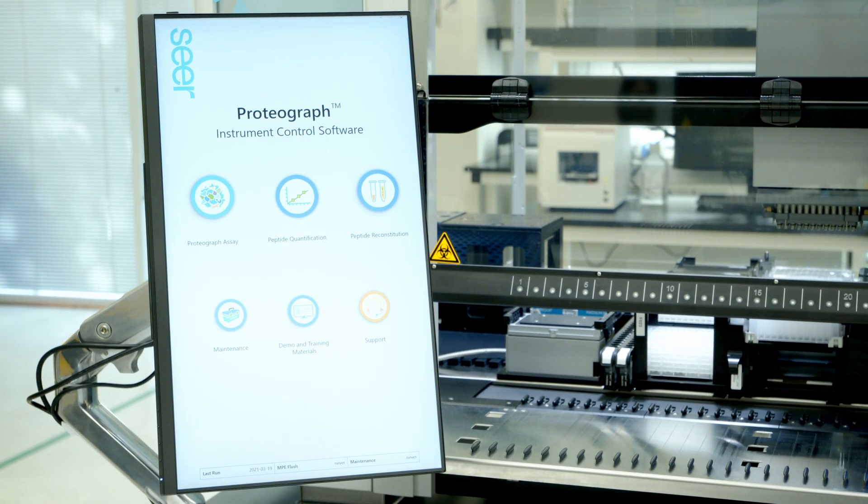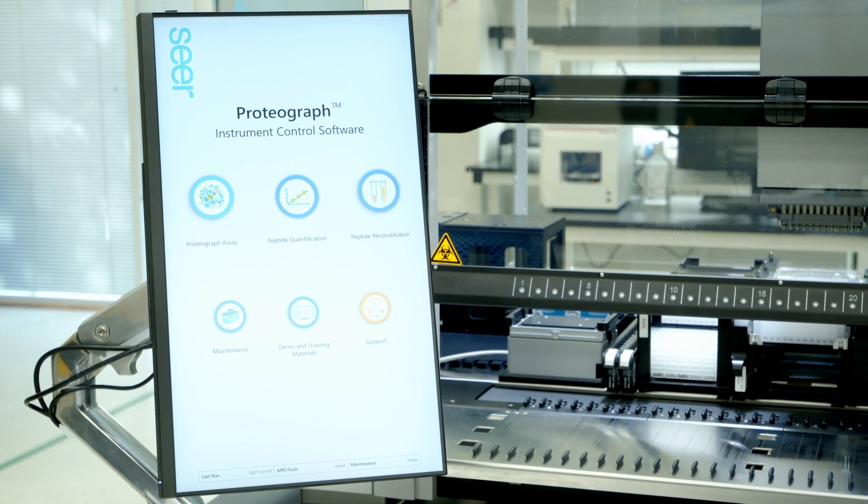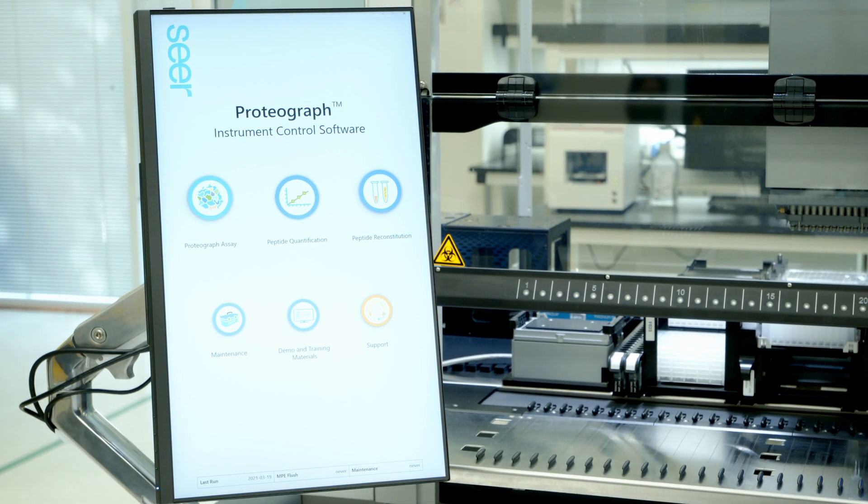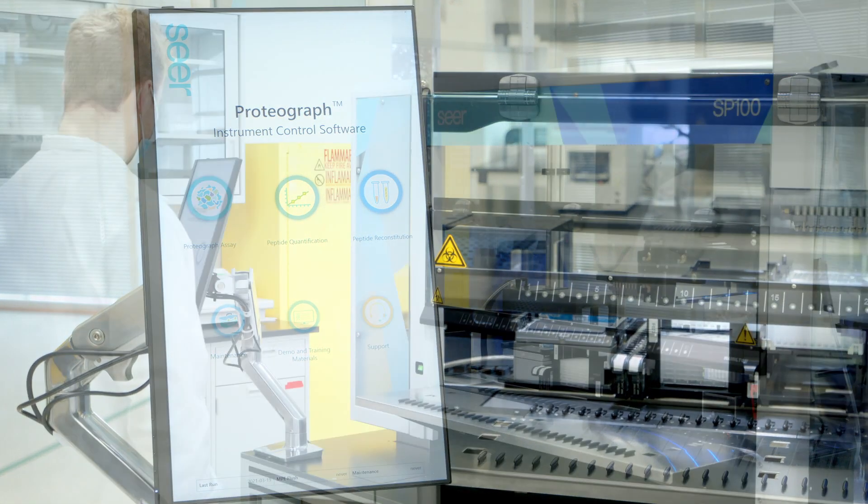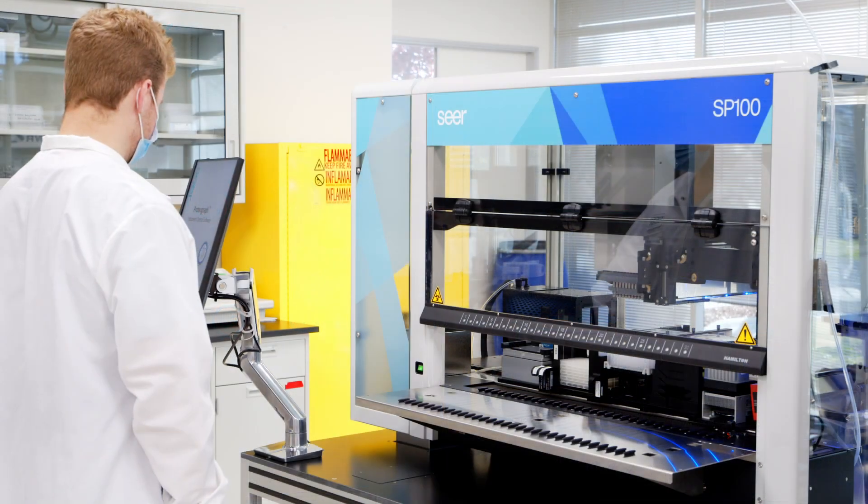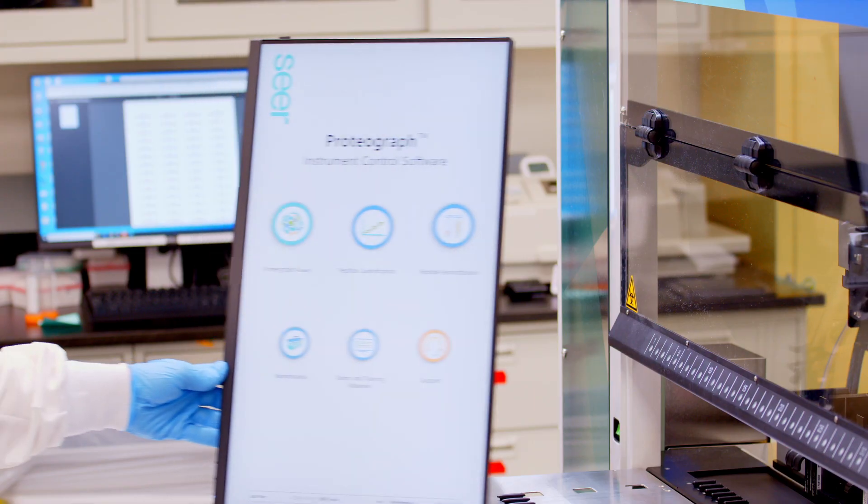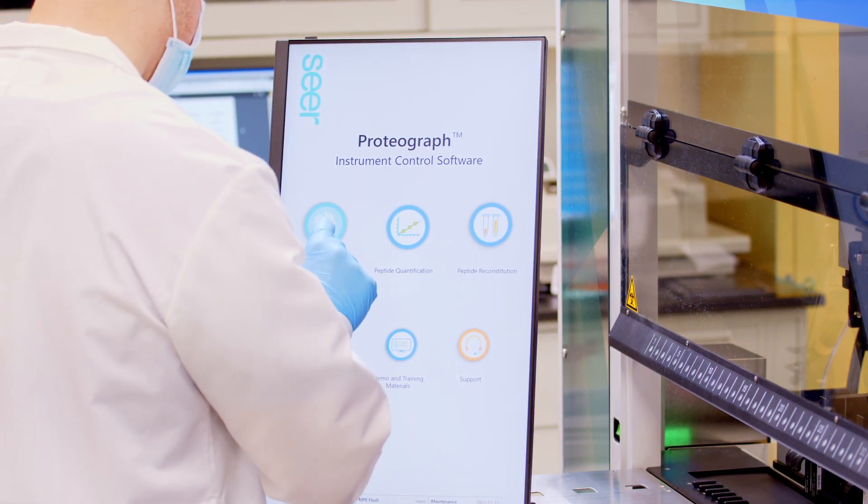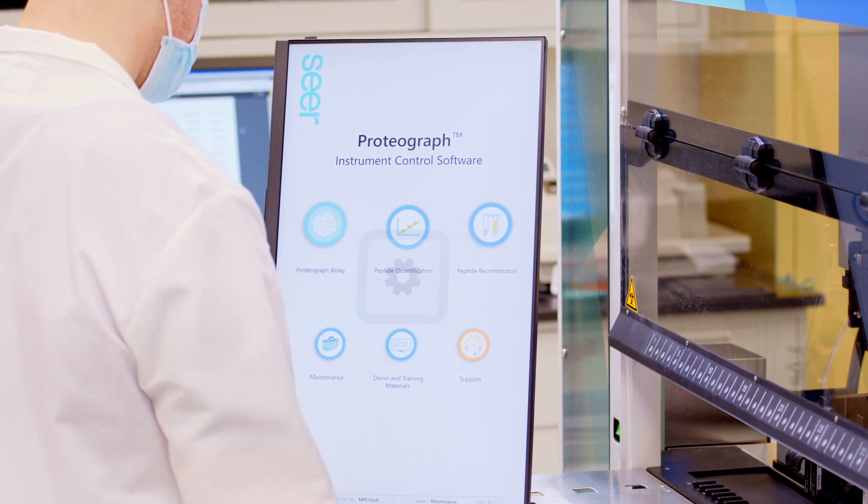The ICS touchscreen is used for self-guided operation of the SP100. It is attached to the instrument via an adjustable arm for ease of use and is glove compatible.